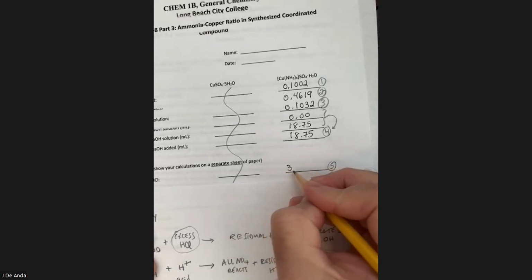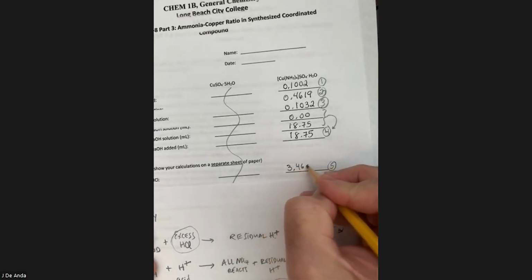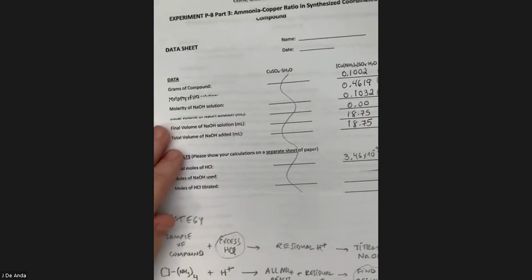Okay, so let's go ahead and copy that over here. 3.46 times 10 to the minus 3 moles of HCl. Now let's see how many moles of NaOH were used. Oops, sorry, I'm going to roll this over here. This is going to be item number 6. Let me shrink this just a tad. There we go, so you can see the whole thing.